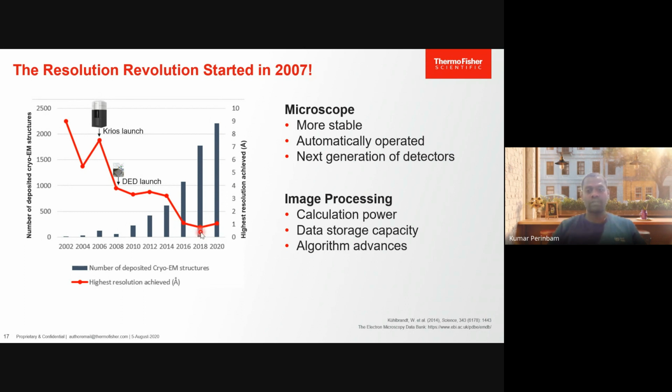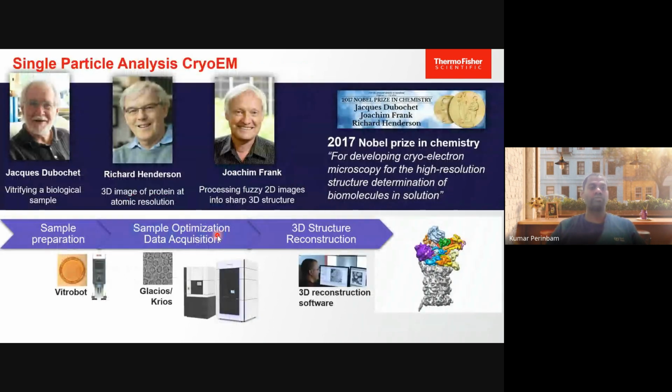Selectris is where you select a band of the electron beam, so you can get a better image. So the moment we reached there, we got somewhere around 1.15 angstrom resolution, and from that time onwards, we have been consistently getting atomic resolution biomolecular structures.